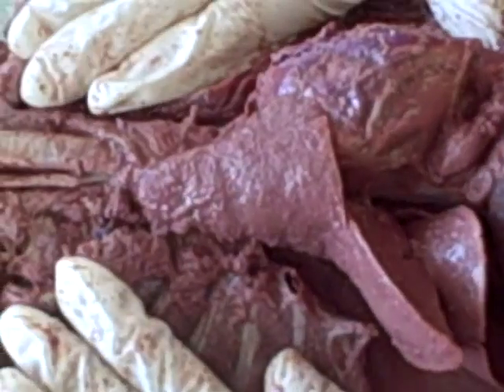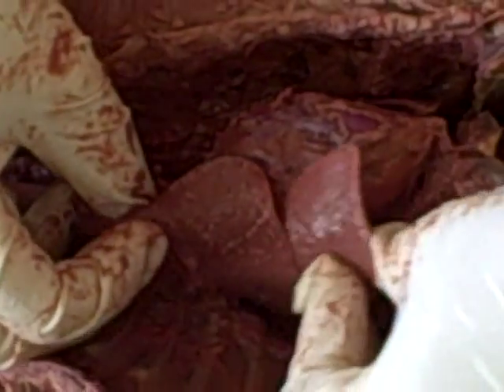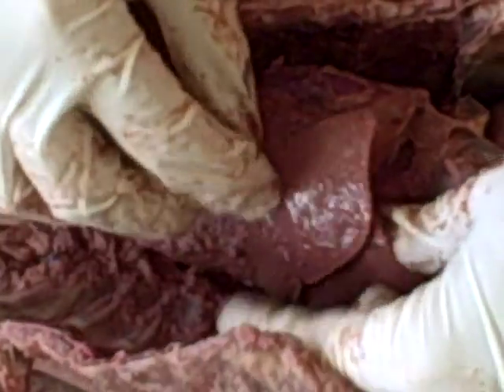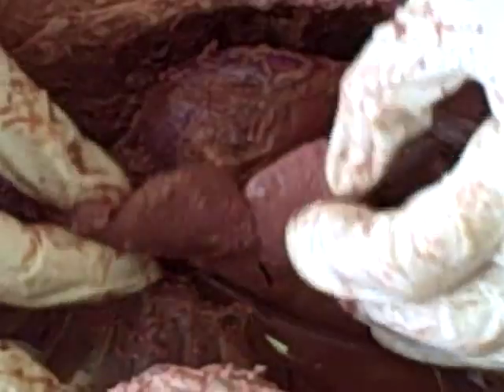Continuing on down, after we have cut the ribs, and you have to cut the clavicles, you kind of break the rib cage down like this and snap the ribs, revealing the thoracic cavity. In the thoracic cavity, you have this lobed organ here. There are 3 major lobes on this side. You see that? 3 major lobes here.